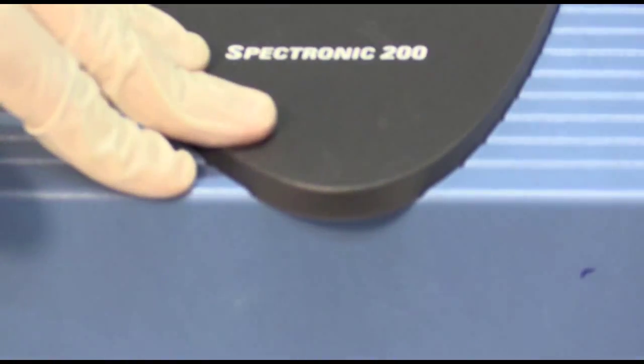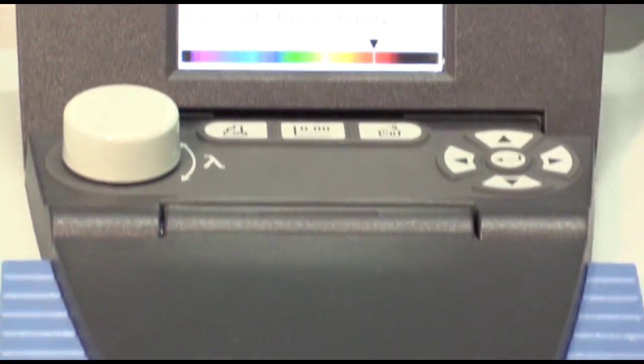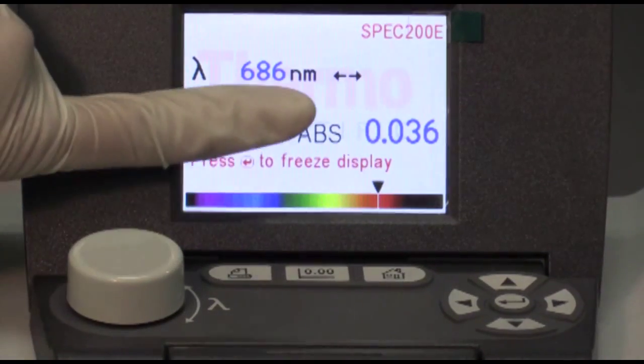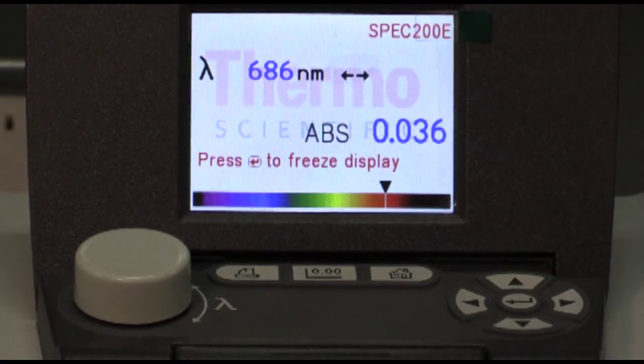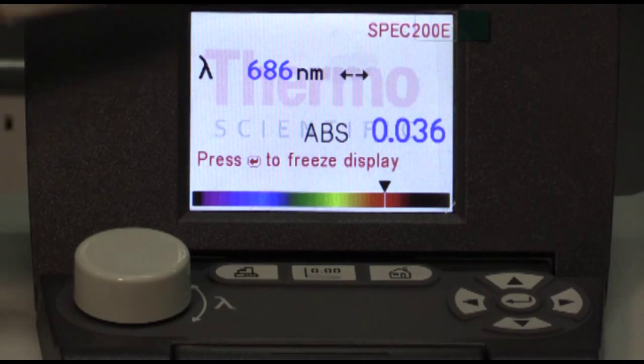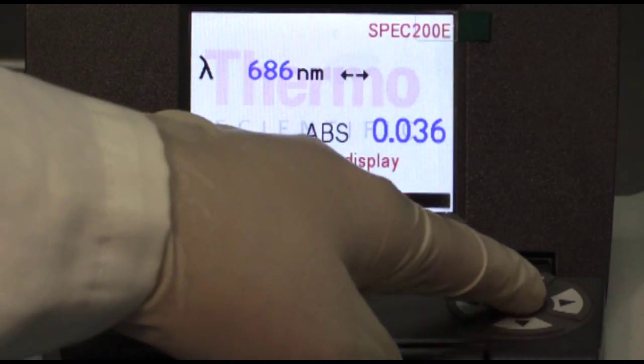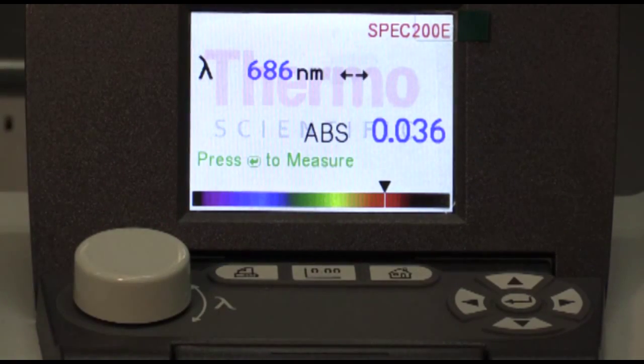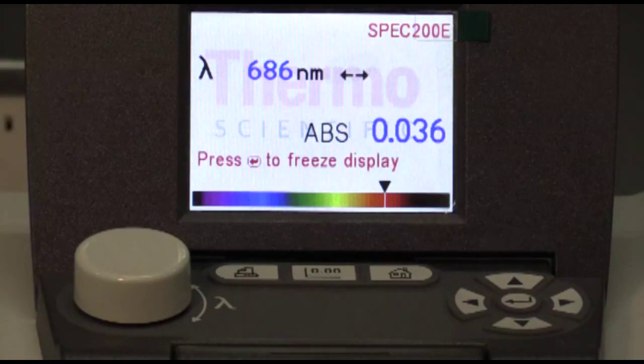Close the compartment, and just wait for the reading to stabilize. Make sure that the numbers are always flashing, which means it's reading in real time. If it is not flashing, make sure you press the enter button until it is flashing, and then you can take the reading.